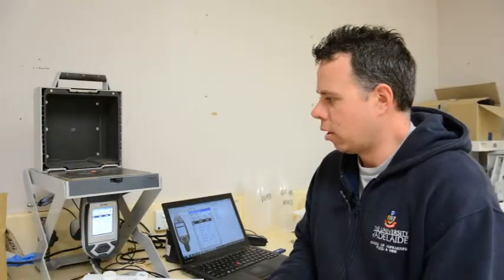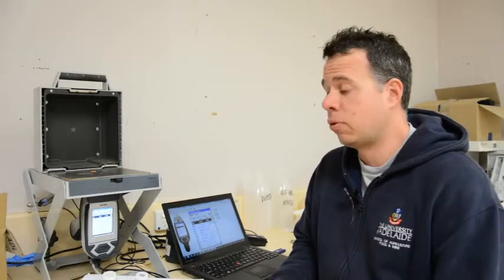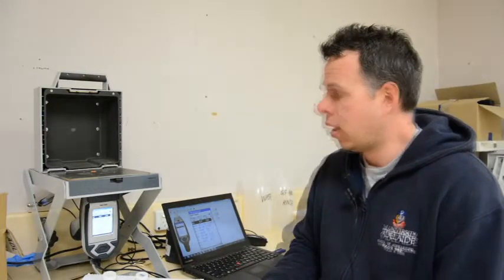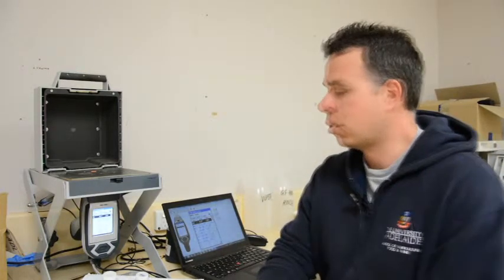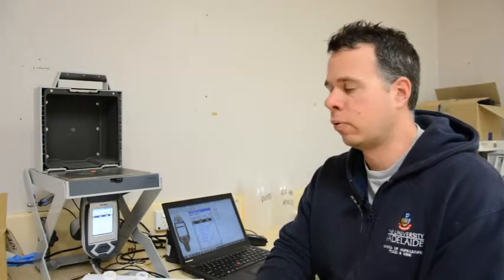So we managed to get hold of an XRF, X-Ray Fluorescence machine. This one's portable, so PXRF. There has been some background work using X-ray technology to look at total plant nutrient concentrations. We proposed to SAGIT to look at different plant crop types and develop calibrations against an acid digest ICP machine, which is a normal procedure the commercial lab goes through, which has associated costs and labour time associated with getting the end result.